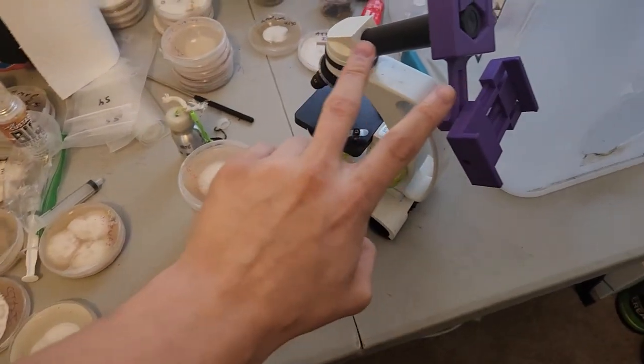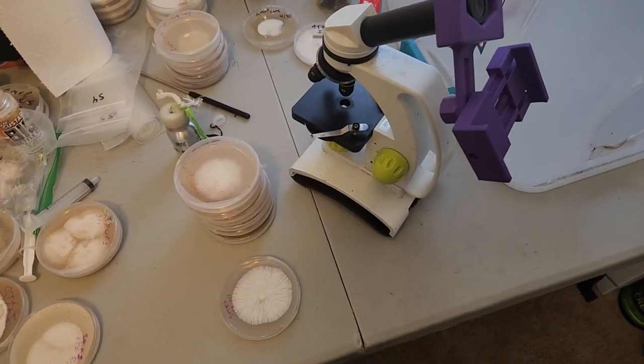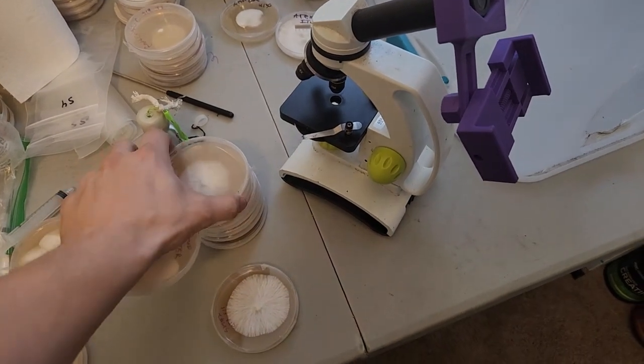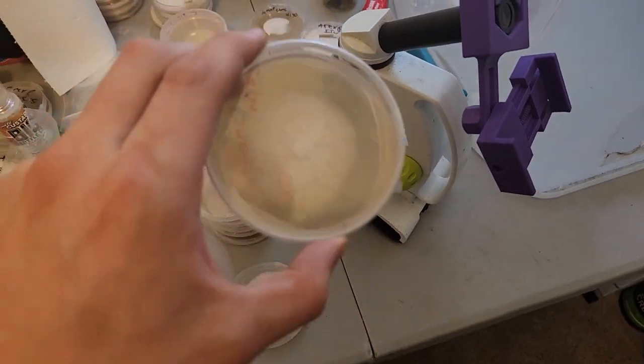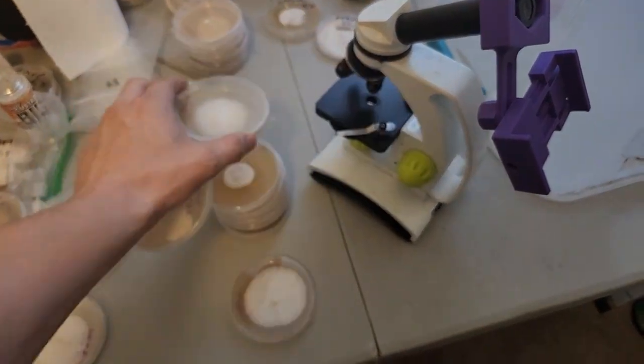What's going on guys? Today I'm going to show you how I like to check potential monocaryons for clamp connections.